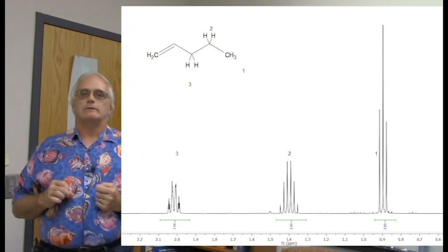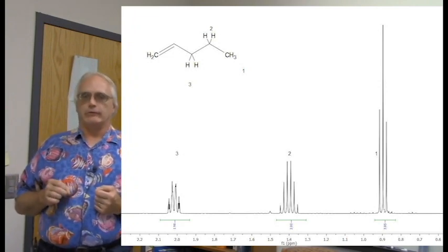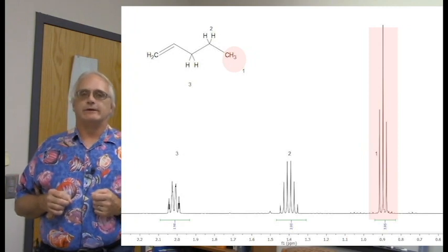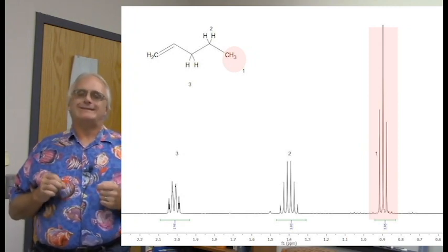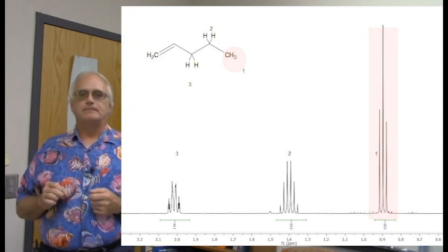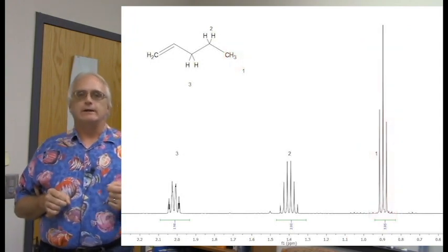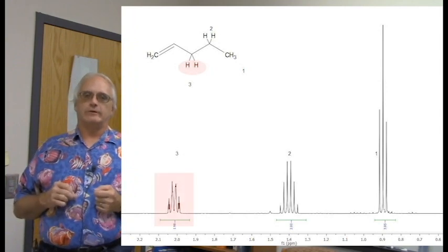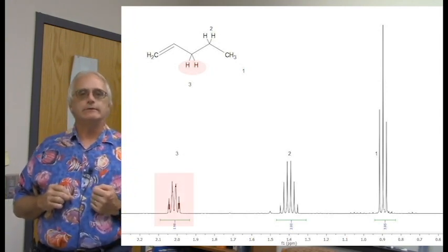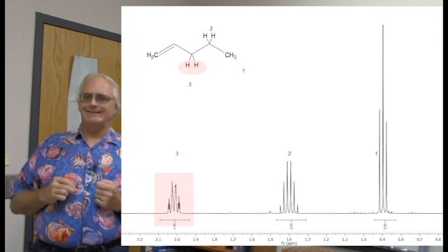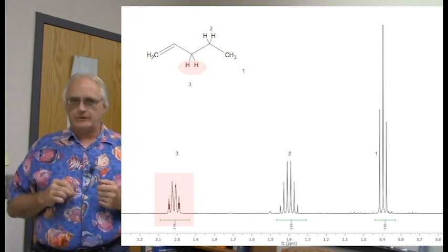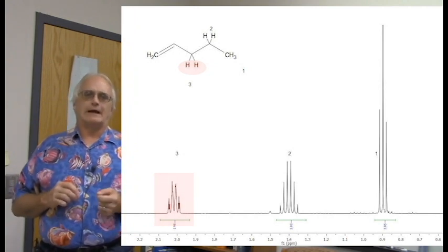And taking a quick look at group 1, for example, the methyl group, a little bit less than 1. It has two neighbors over there in group 2. It is just a textbook perfect triplet, just absolutely lovely. Over here at group 3, it's a quartet. Two neighbors on one side, then the first alkene proton on the other. It's not a clean quartet. It's not as pretty as you would expect a quartet to be. There are other things going on. We'll worry about that one later.